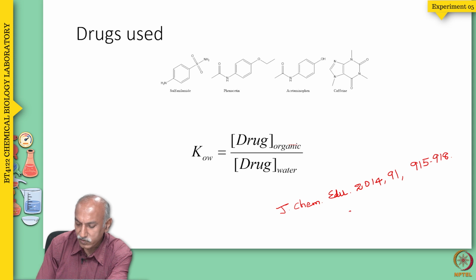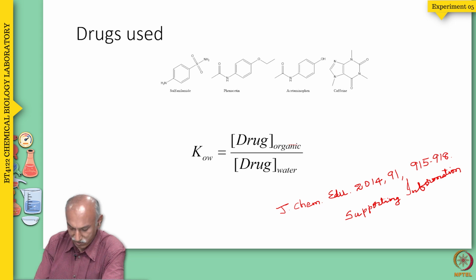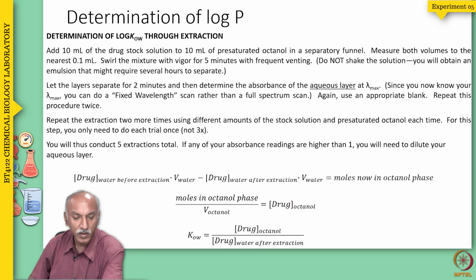Please go through the supporting information of this entire article. It gives a very elaborate experimental procedure, how to make the saturated octanol and water saturated with octanol and everything. It has been done very nicely. And how do we determine this through the extraction?